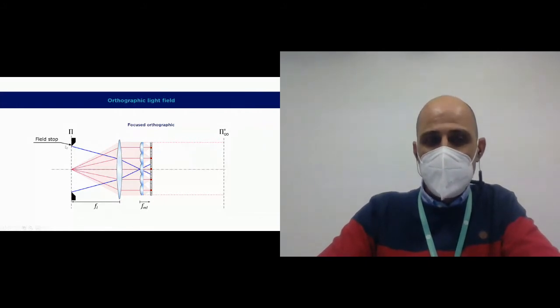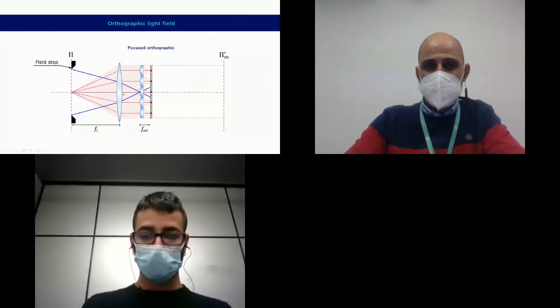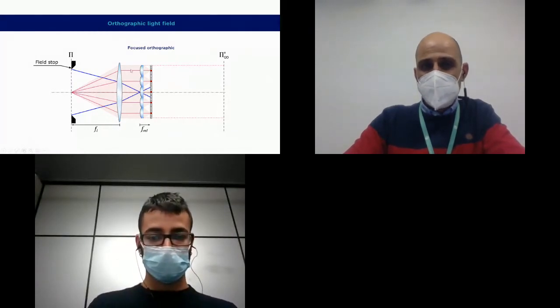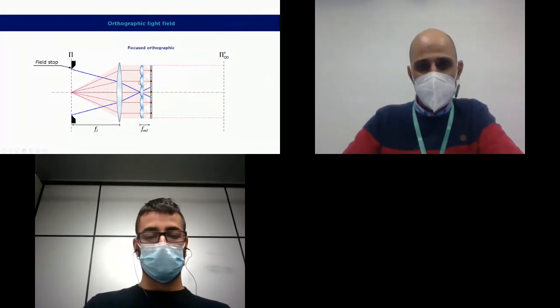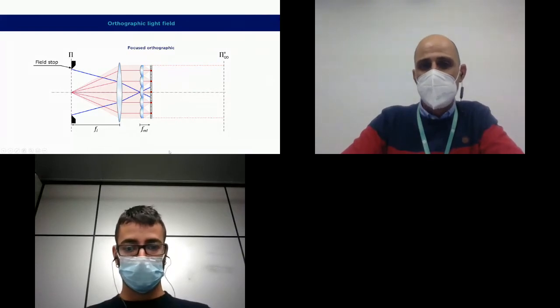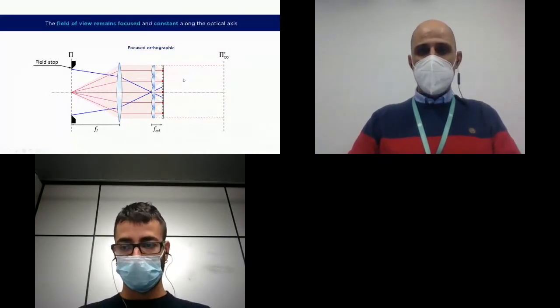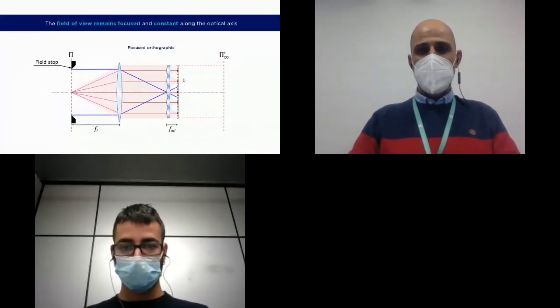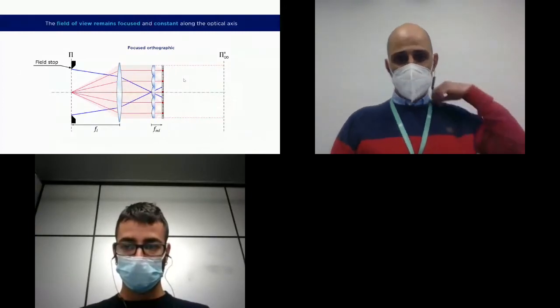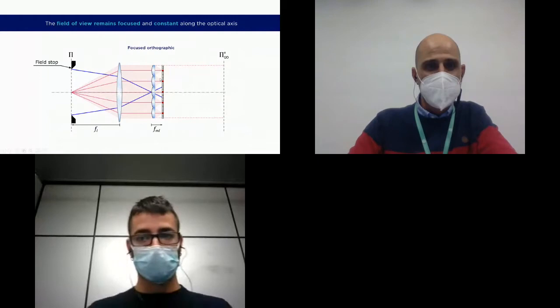The field stop and the object plane are placed at the focal length of the main lens in such a way that the rays are projected parallel towards the micro lens. This way, we can place the micro lens array in any plane and keep the image focused and the field stop in the proper size and plane.